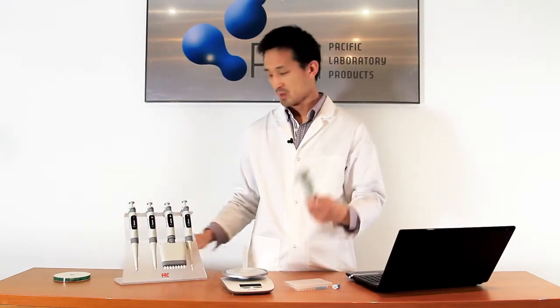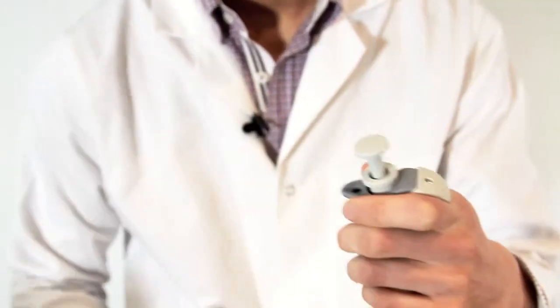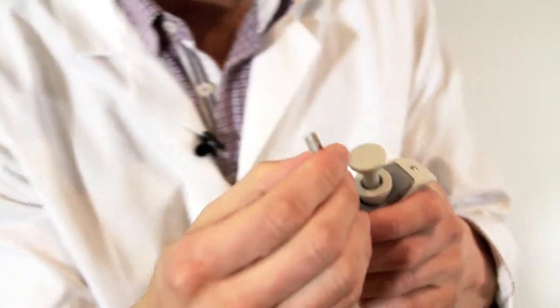Pipettes are also autoclaveable and calibratable if you have a microbalance. There's a locking mechanism which you insert here, and you flick up to stop it from slipping calibration. Then you remove the cap here and adjust if you need to.